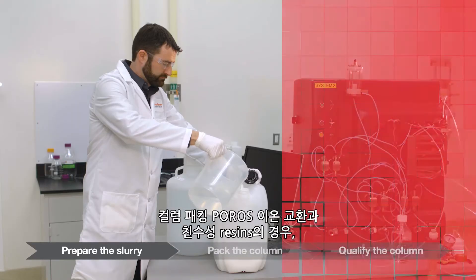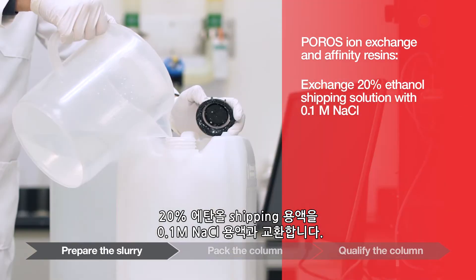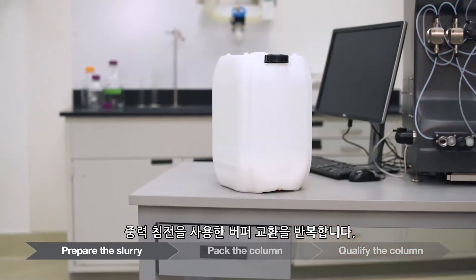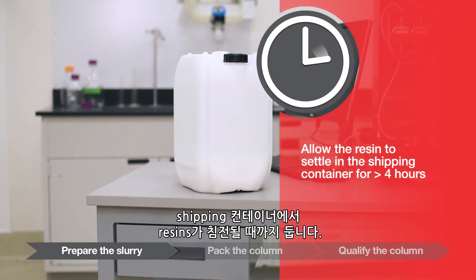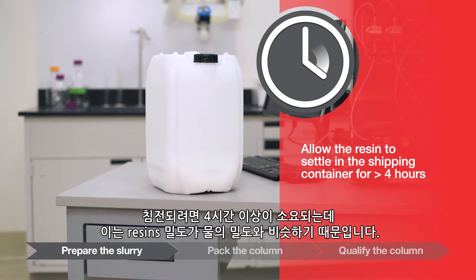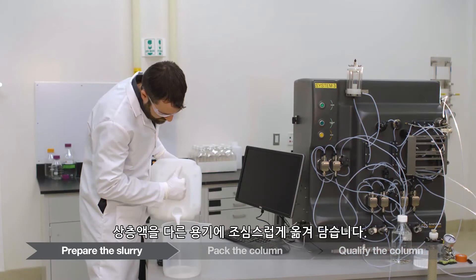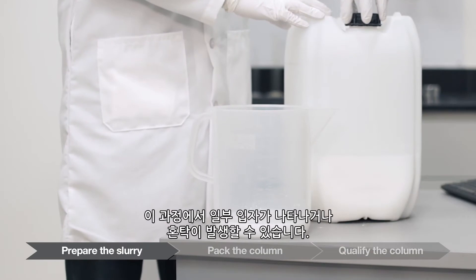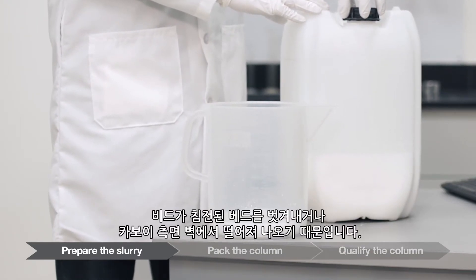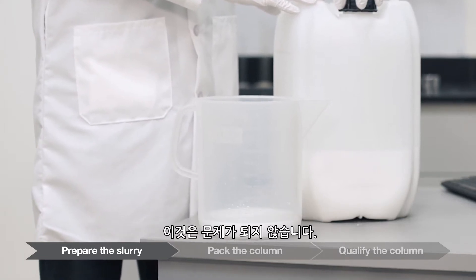For column packing Poros ion exchange and affinity resins, exchange the 20% ethanol shipping solution with a 0.1 molar sodium chloride solution using repeated gravity settling. Allow the resin to settle in the shipping container — settling requires greater than four hours because the density of the resin is approximately that of water. Carefully decant the supernatant without disturbing the bed. Some particles or turbidity may be present in the decant as beads slough off the settled bed or come loose from the carboy sidewalls; this is not problematic.